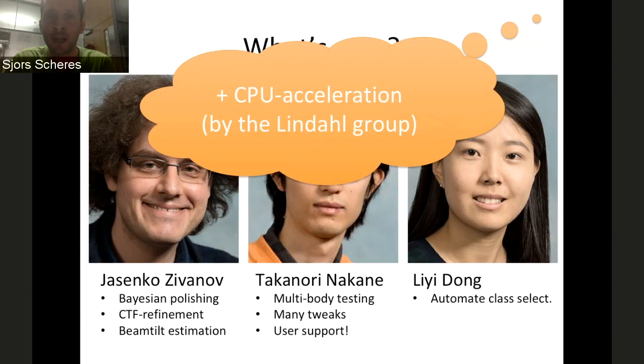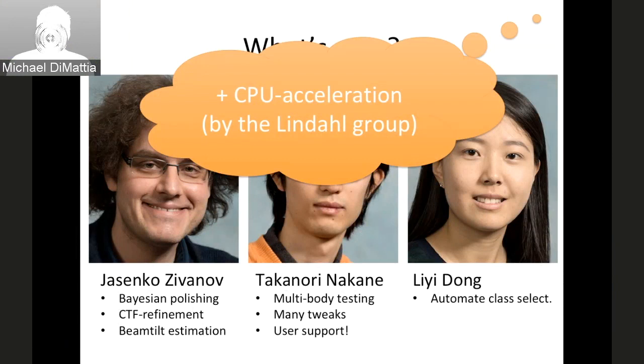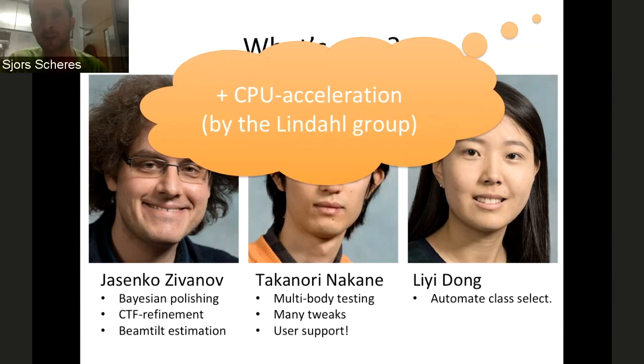and they did the GPU acceleration of Relion 2. Now, as part of Relion 3, they've done similar unwrapping of the very intricate loops in Relion's inner core, such that you can use vectorization on CPU.